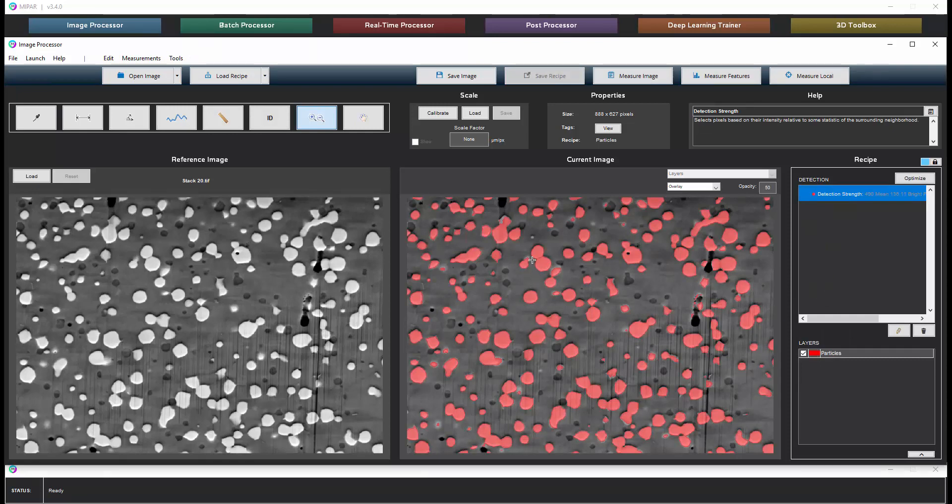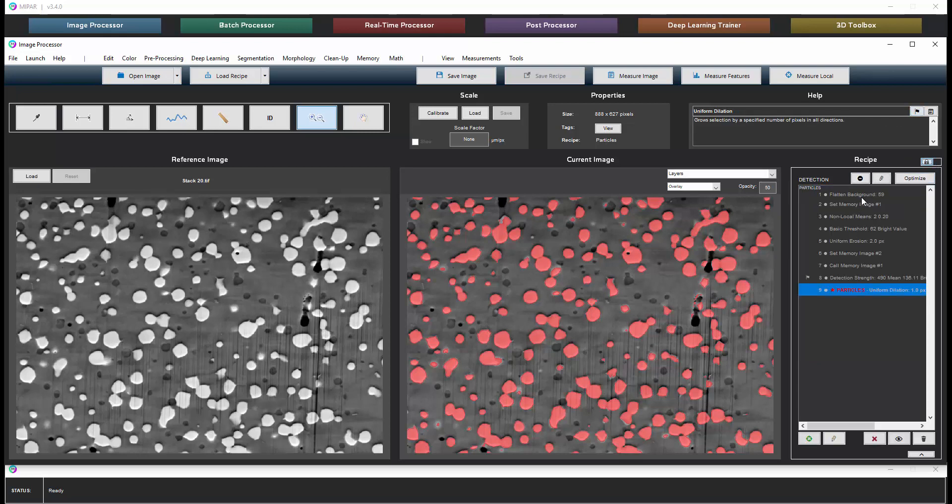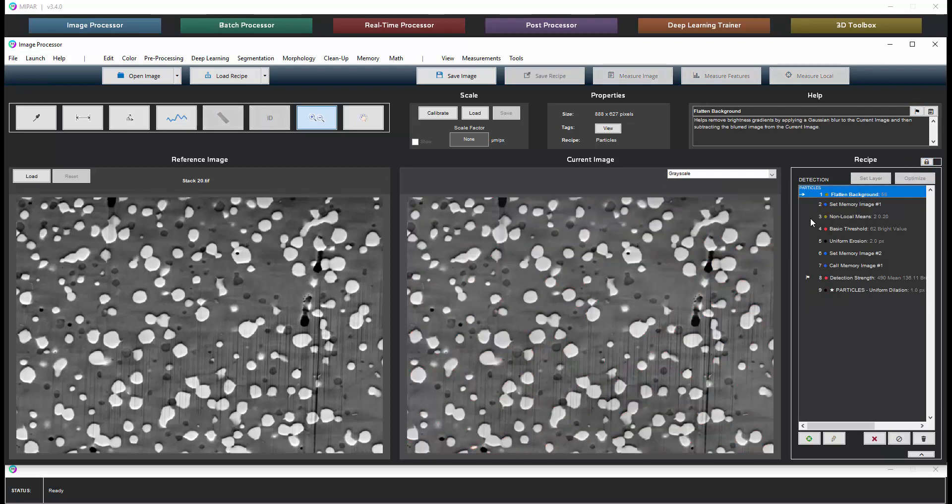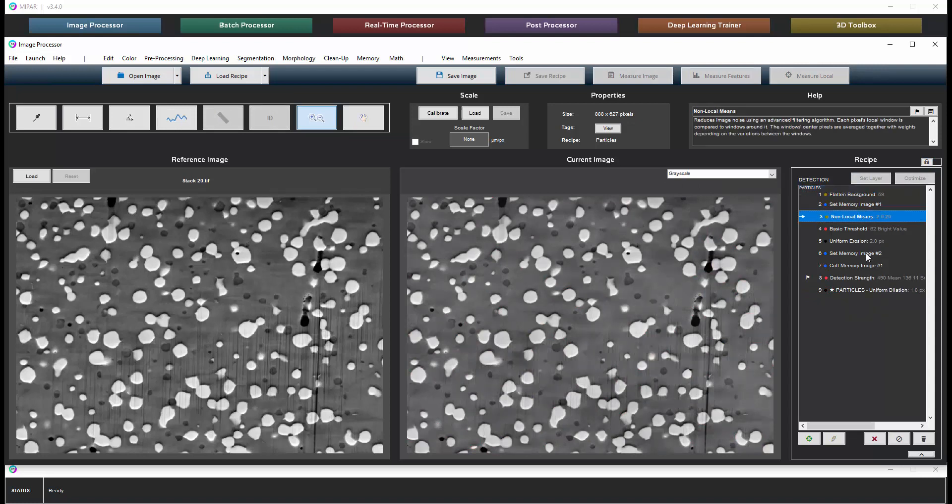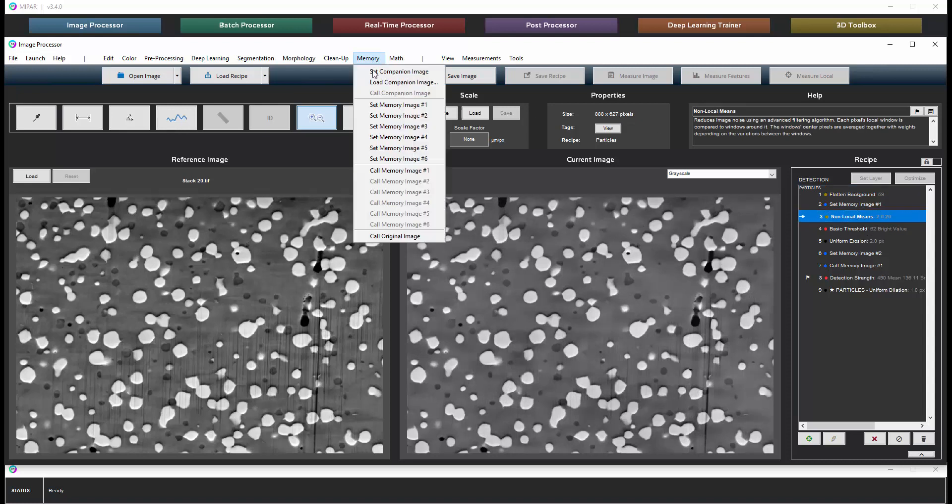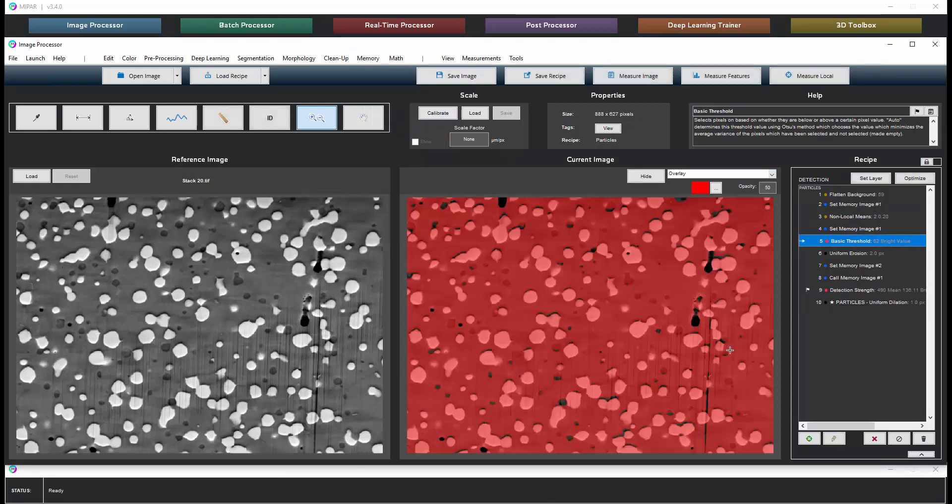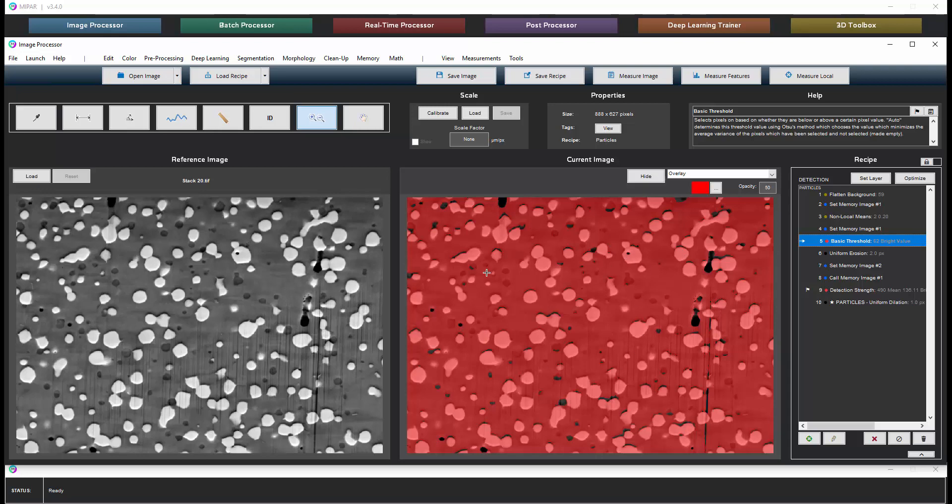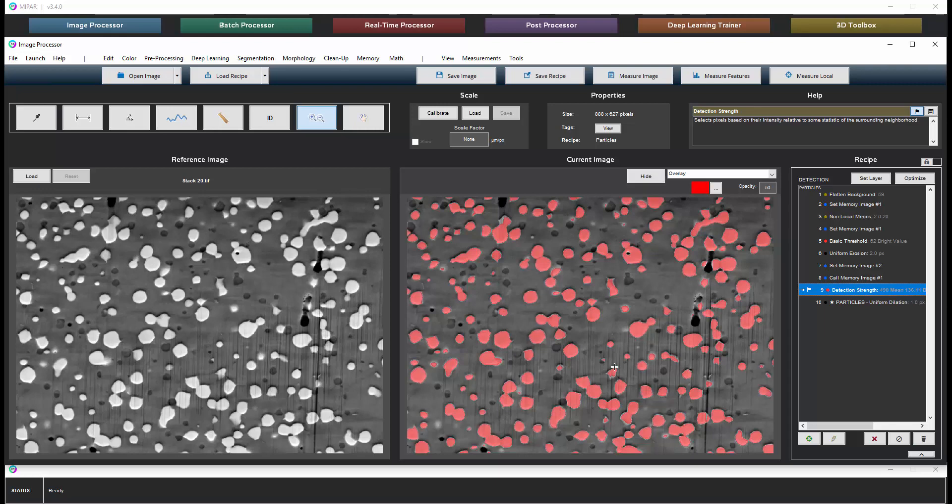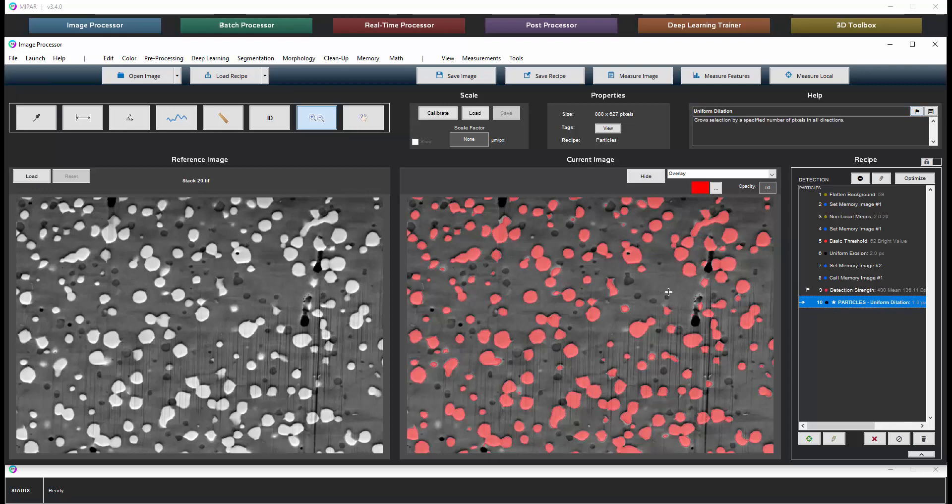So the recipe building will obviously differ for each sample, for each type of analysis. Briefly, this was a fairly simple recipe which performed a background flattening followed by a noise reduction step followed by a threshold to select everything except the very dark regions so that we can then do a localized threshold within the red area here and this gives us our particle selection which we then refine with a slight dilation.